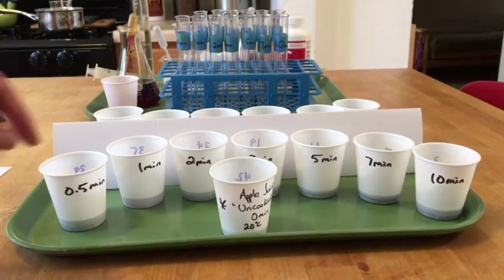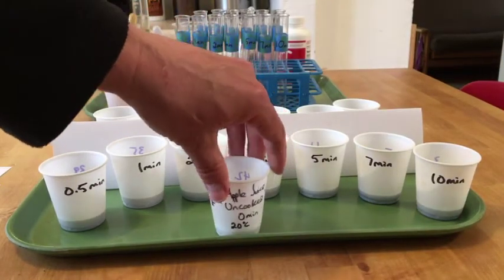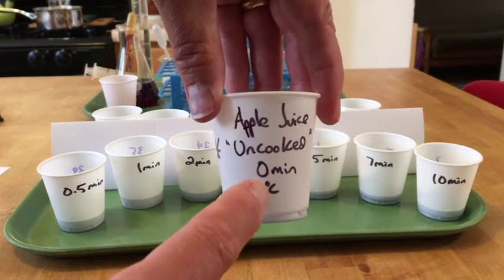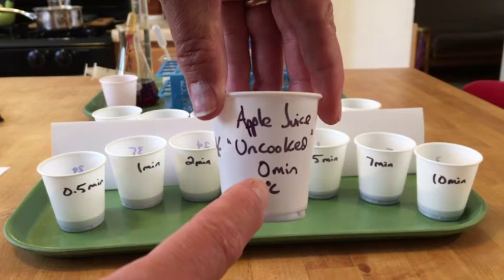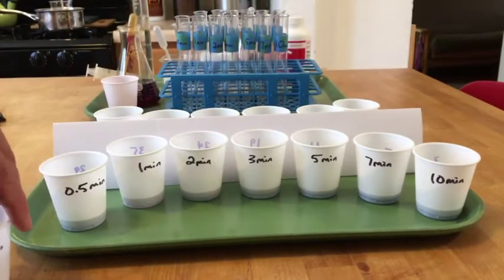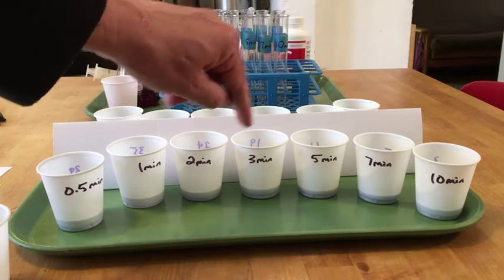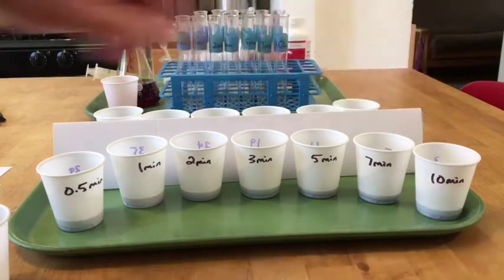So here are the cups. This first one is the one that was uncooked. So the amount of time that it was cooked is 0 minutes. So that's the time. And then each of these was cooked for 0.5, 1, 2, 3, 5, 7, and 10 minutes.